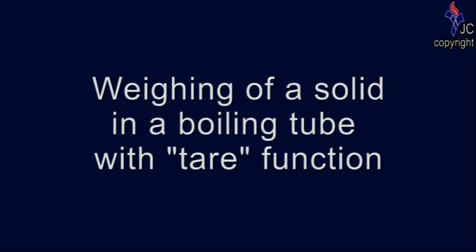In this video, you will learn about the steps to take to weigh a solid sample in a boiling tube on the weighing balance with the use of the tare function.